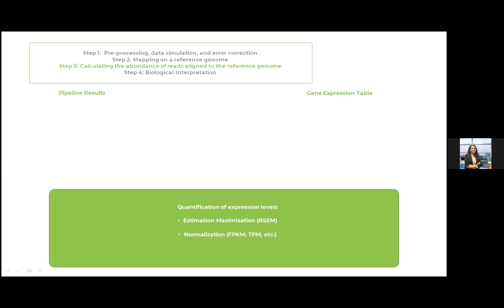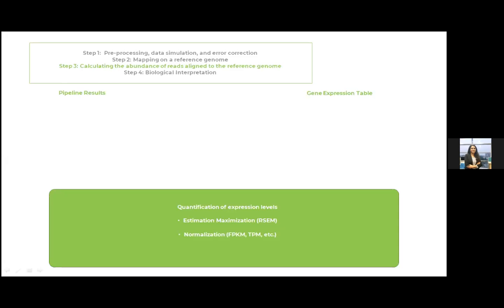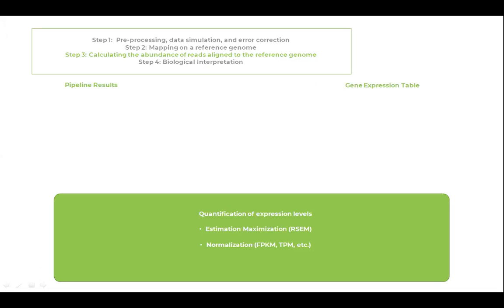Once reads are aligned against a set of reference transcripts, next is quantification. The different quantification methods like HTSeq and RSEM count the number of reads against each transcript. Then they convert read counts into relative gene expression levels. It can be performed by Sailfish, RSEM, and HTSeq.